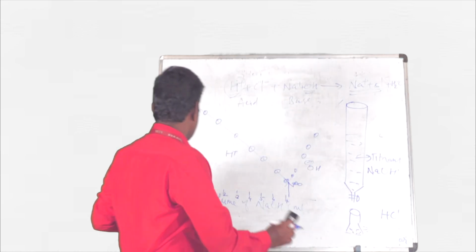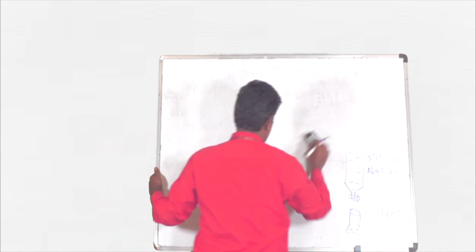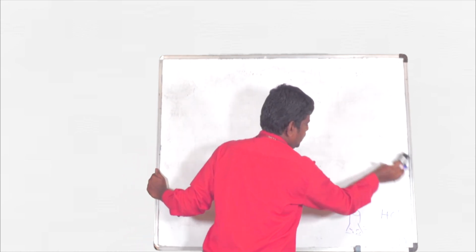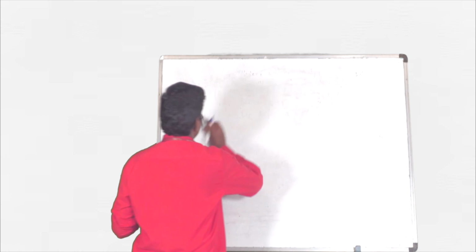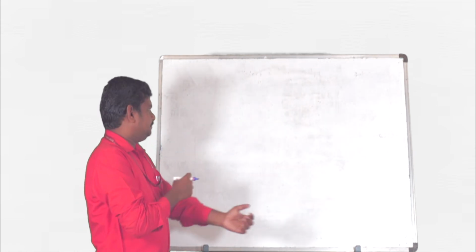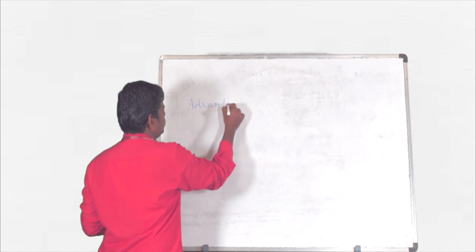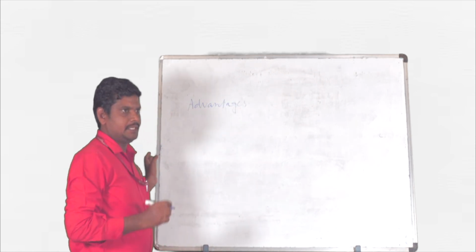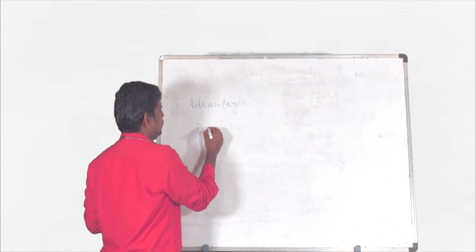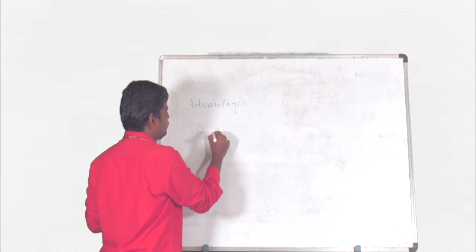So, the applications. But before the applications, let us discuss the advantages. Where all are we using the conductometric titration? The first advantage is that we can run the titration in the absence of indicators.